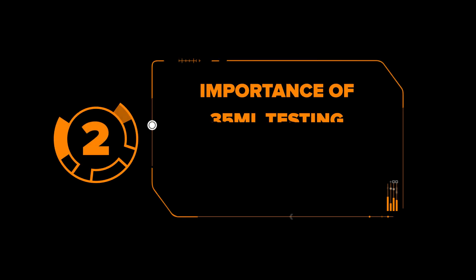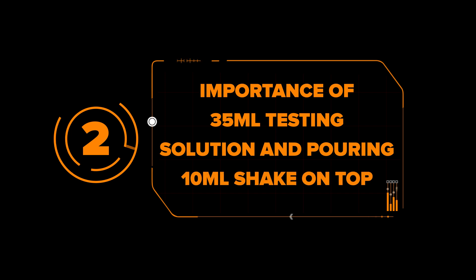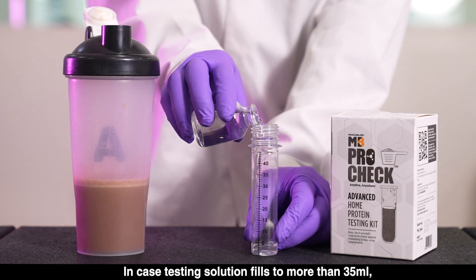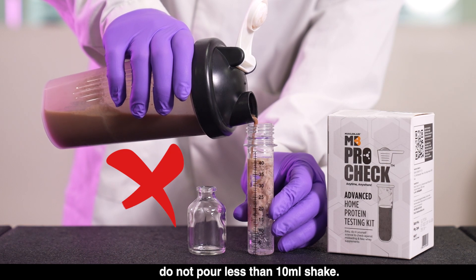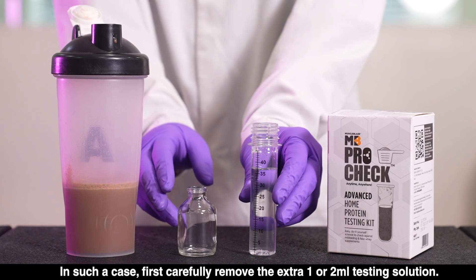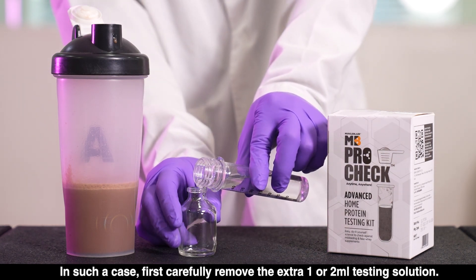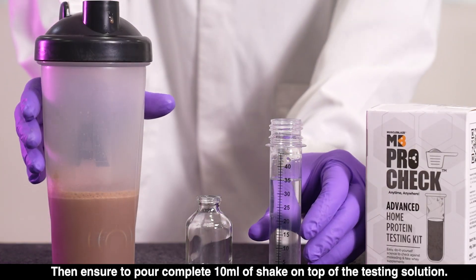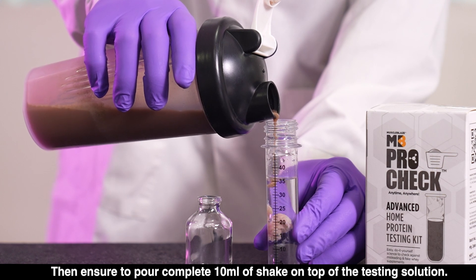Mistake 2: Importance of 35 ml testing solution and pouring 10 ml shake on top. In case the testing solution fills to more than 35 ml, do not pour less than 10 ml of shake. In such a case, first carefully remove the extra 1 or 2 ml of testing solution, then ensure to pour the complete 10 ml of shake on top of the testing solution.